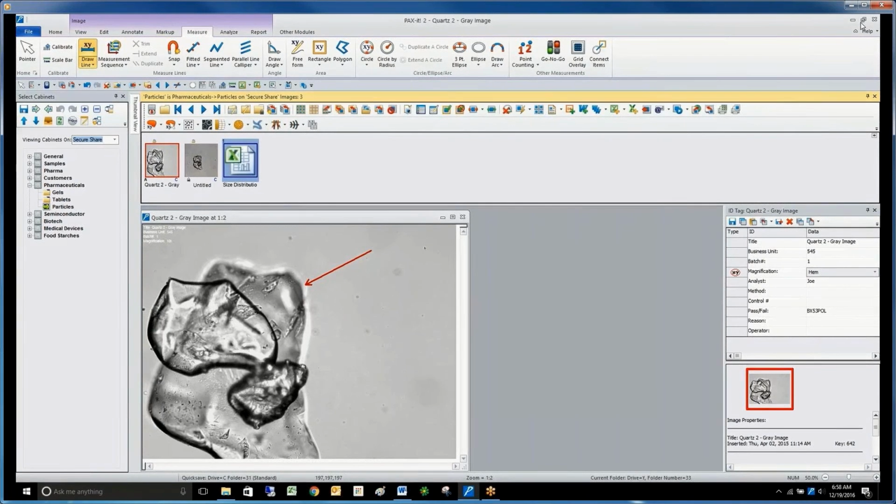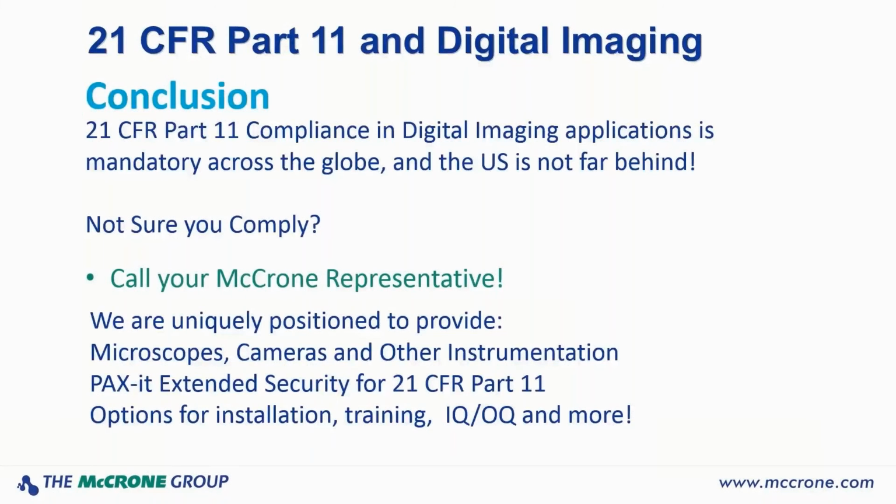Digital signature functions can apply in different ways to secure reports according to your lab's specific workflow. At long last, scientific imaging applications finally have a program with both the flexibility necessary to complete their imaging tasks and meet Part 11 requirements.